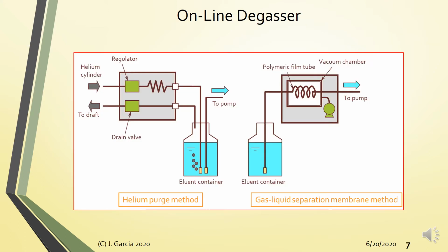So next, we have your online degasser. Again, the purpose of which is to remove any dissolved gases in your mobile phase before it enters the chromatograph. Okay? Why? Because if you have a high pressure environment, no, yung liquid nyo is subjected to a high pressure environment, the dissolved gases will tend to form bubbles, okay, which may disrupt the rhythm of the pump, as well as this will cause high back pressures also, no, when these bubbles pass through the column.